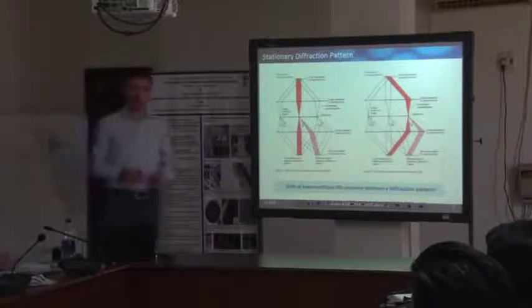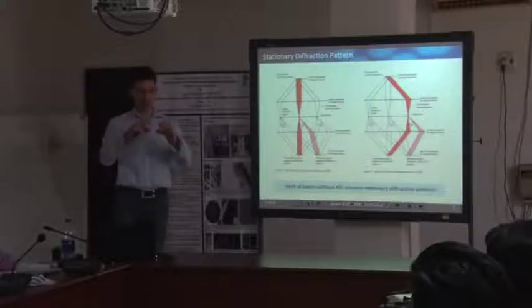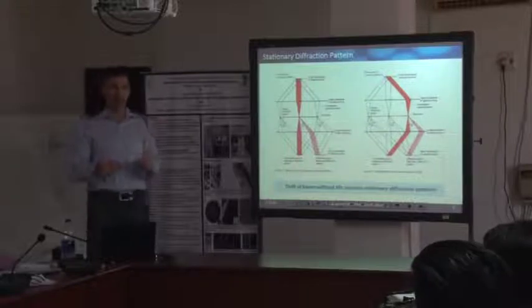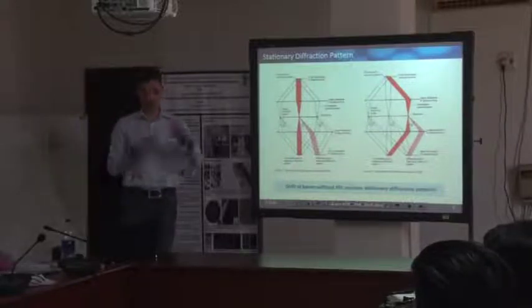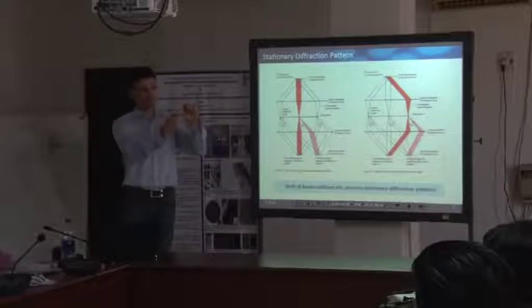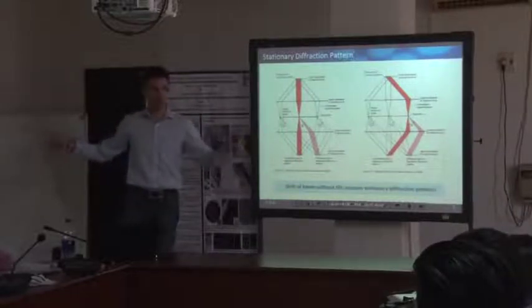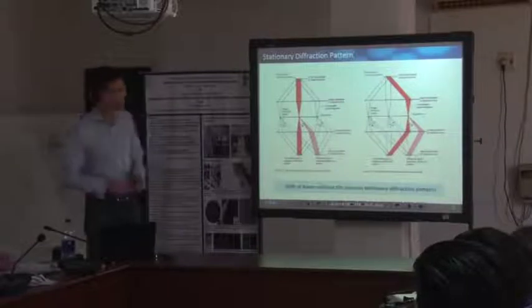Meaning that the path of our electron, just imagine a thin sample, and if you do so in a scanning electron microscope, the path length through the sample becomes larger for larger scan fields, isn't it? I mean, this is simple geometry.